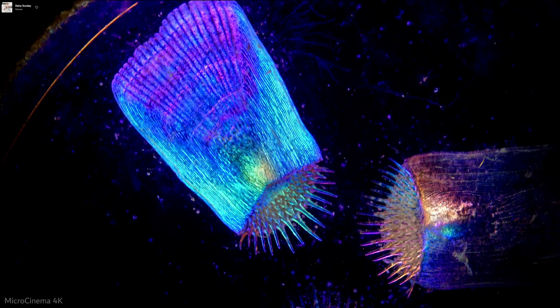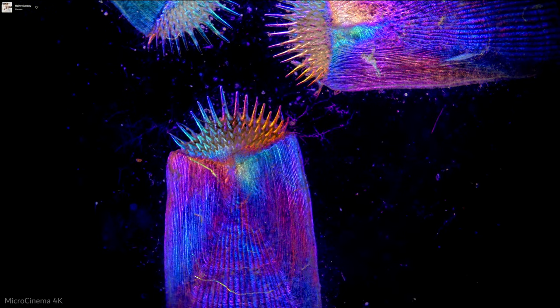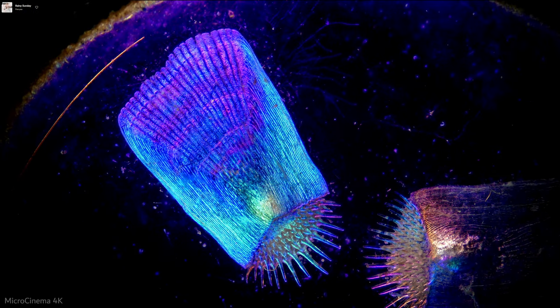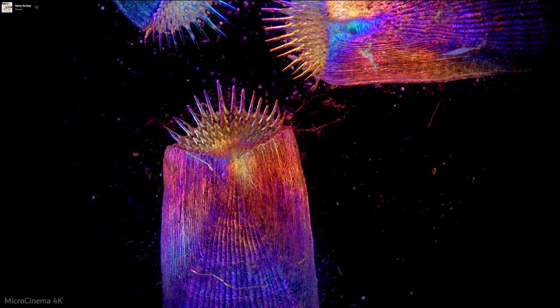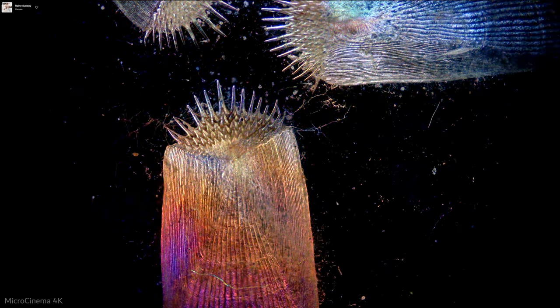and next time I'll try to have some samples that are mostly alive, as opposed to mostly dead. And maybe I'll talk to Pacific Plankton a little bit about the intricacies of preparing marine slides. Here, I'm just putting some deli container plastic under here.